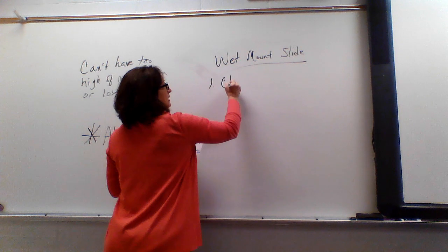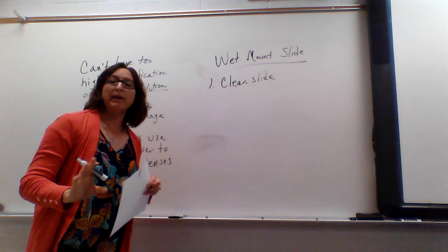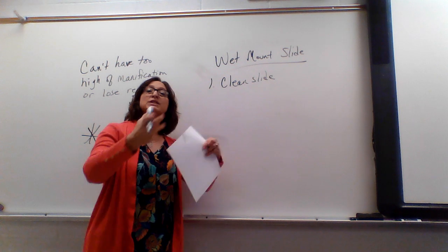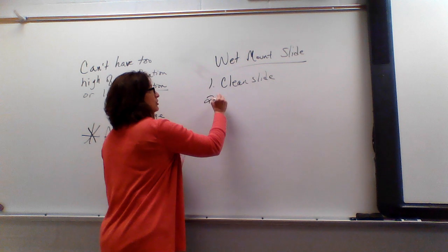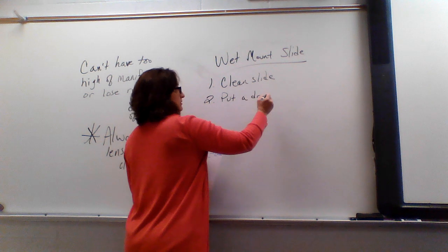The first step is always clean your slide. When we put them back in the box, sometimes we're in a hurry and don't have time to clean them, so we always clean them when we get them out. Start with a clean slide. Number 2, you're going to put a drop of water on the slide.